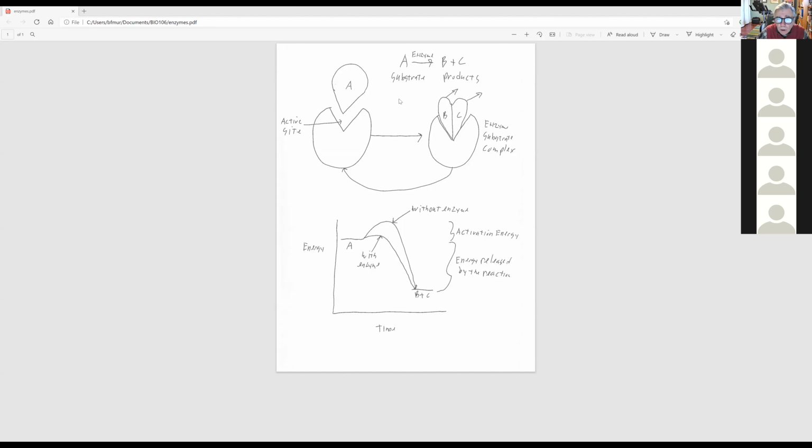The thing to the left of the arrow, if this was a non-enzymatically catalyzed reaction, would be called a reactant on the left side of the arrow. But in an enzyme-catalyzed reaction, that's called a substrate, right? And then the enzyme is right here, and we'll be testing an enzyme called catalase. And here are the products.